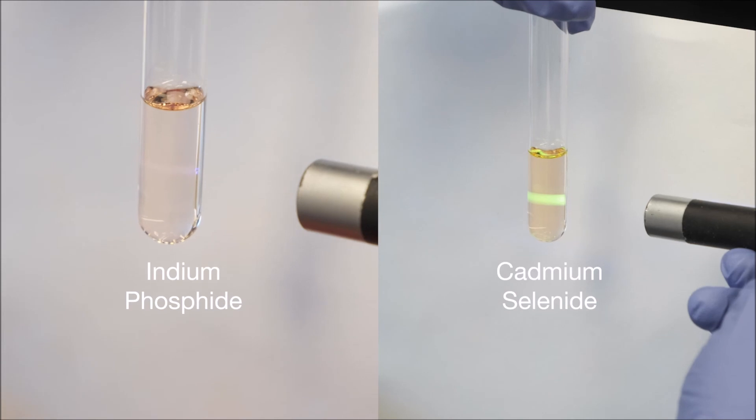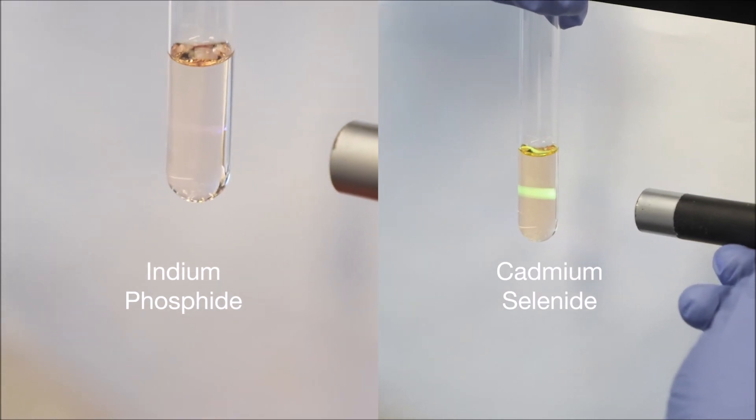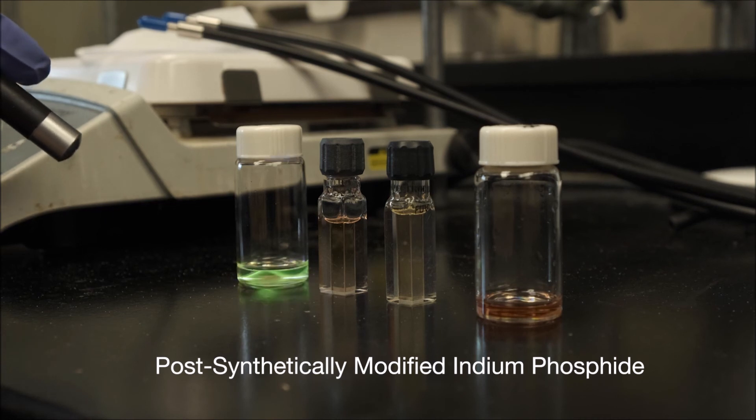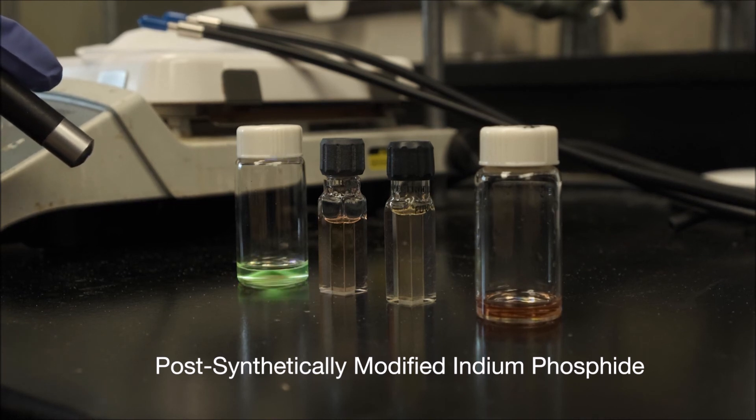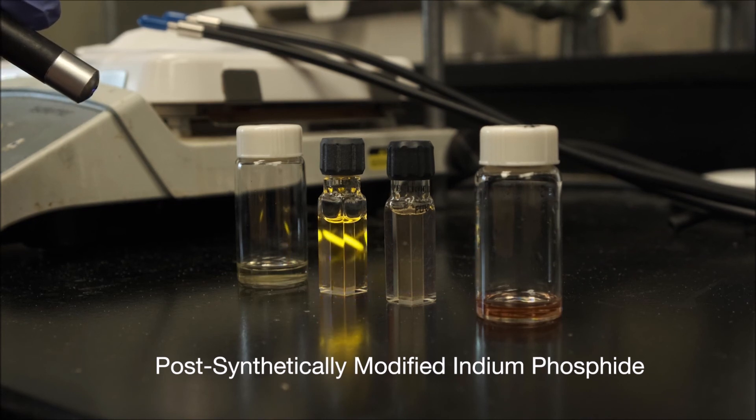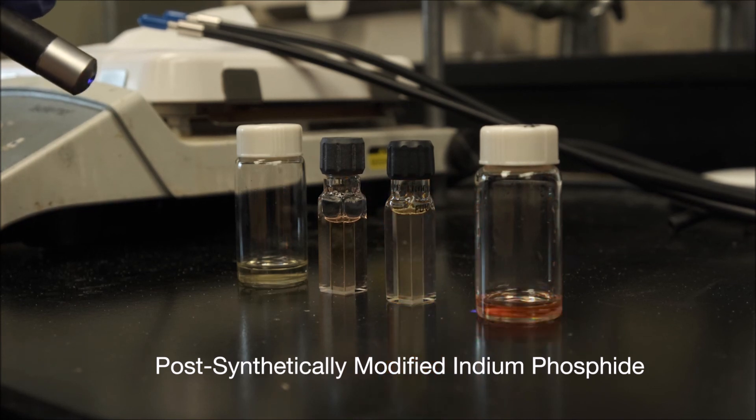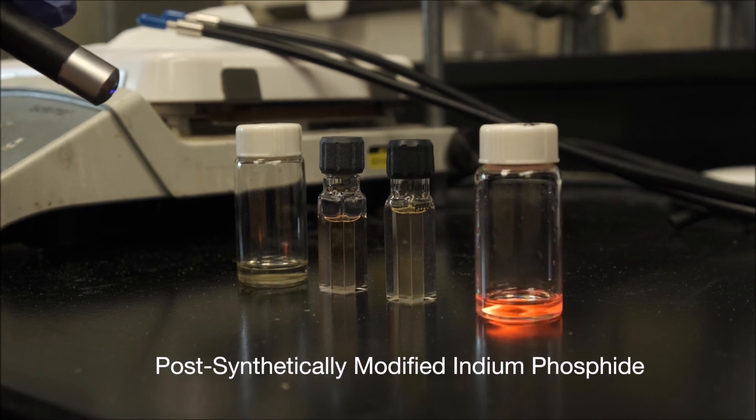As synthesized, indium phosphide quantum dots are not efficient emitters. However, post-synthetic modifications of the surface can be performed to not only improve their emissive efficiencies but also tune the colors they emit without altering their size. This is a powerful tool to develop less toxic quantum dot materials for emissive applications.